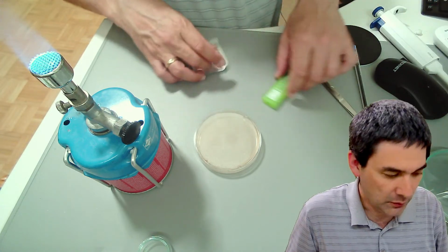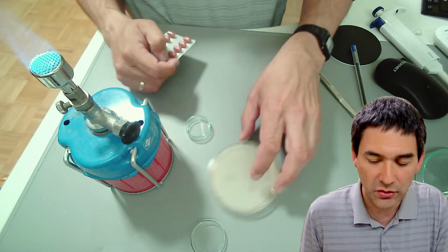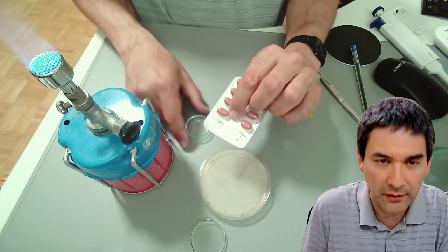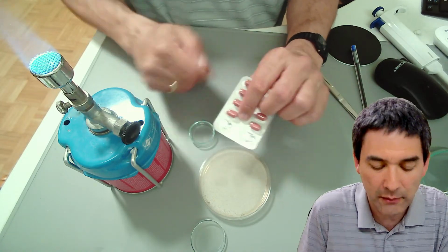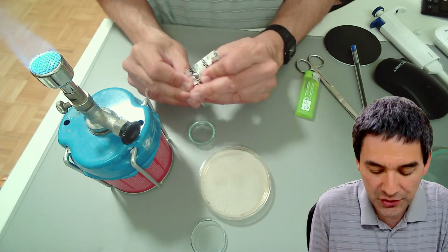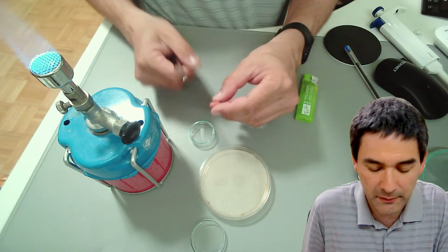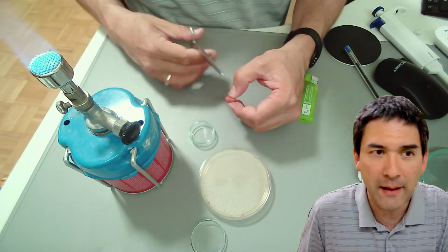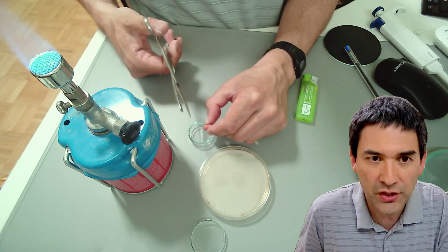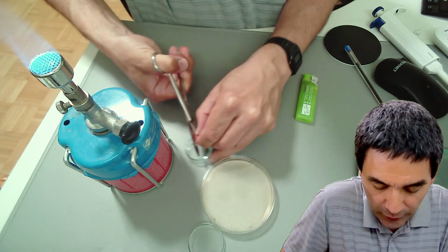And what I'll be doing next is I will be opening next to the flame. I'll be opening one of those capsules, and I'm going to put out the freeze-dried bacteria here so that I'm able to use those. Okay, so I'm just going to take it out. I've also disinfected my hands using the alcohol, but you need a little bit of time here for it to also properly evaporate. Yeah? So, and I'm just going to cut it open. Yeah, and I'm going to put the freeze-dried bacteria, E. coli bacteria in here. Okay. Hopefully without making a mess.